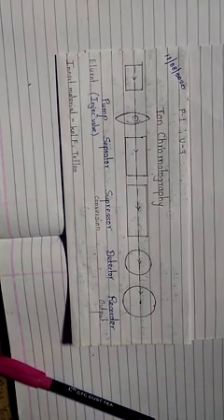Here both cations and anions are used, so it is termed as ion chromatography. I just repeat the principal advantages of ion chromatography: its selectivity, speed of analysis, sensitivity of detection, and the facility of simultaneous analysis.